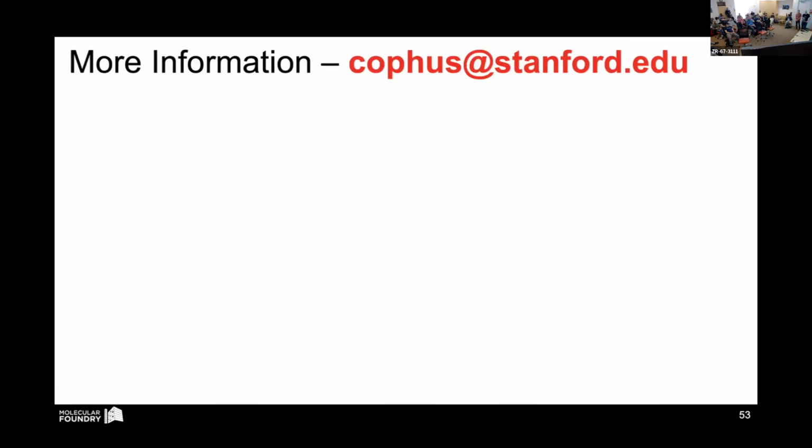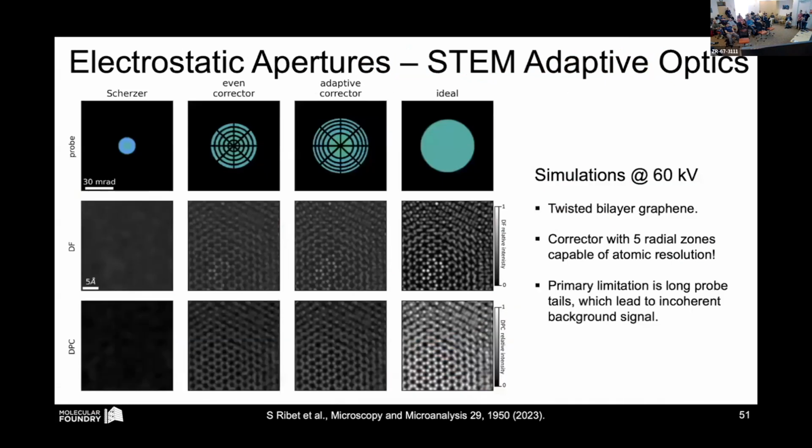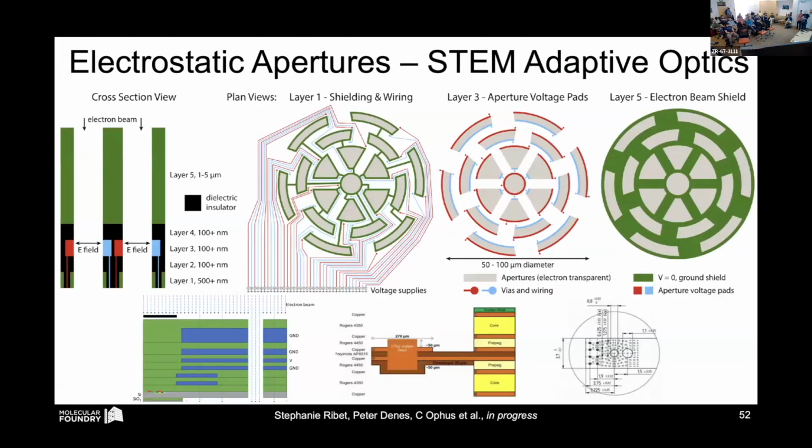I was curious, given the flexibility of your lenses, right? Although with the variations, with limitation and so, can you define a willing and known way and then apply recover images? Essentially, can you perturb voluntarily, can you create a controlled, if you prefer, aberration and then use this to sort out, for example, let's say reconstruction problems. So yeah, to reduce symmetry problems, right?